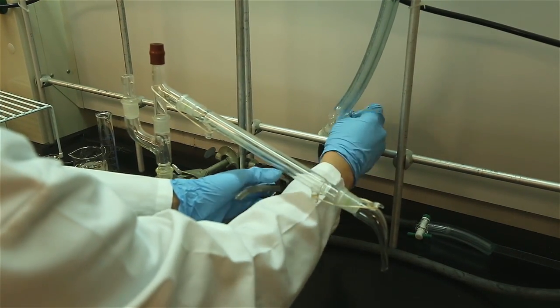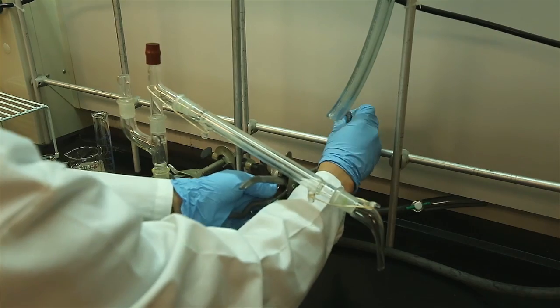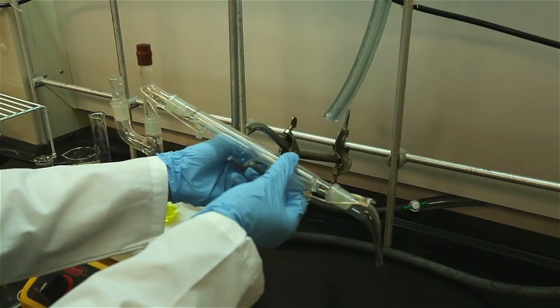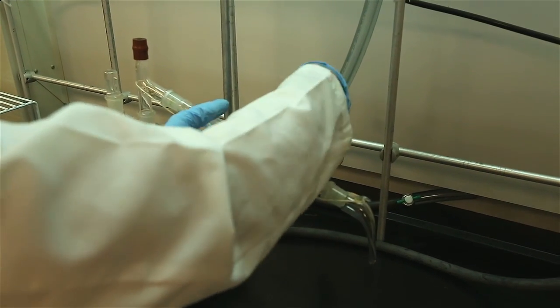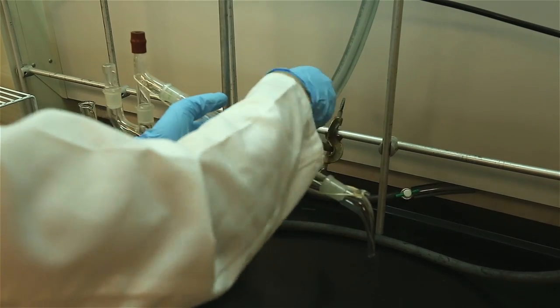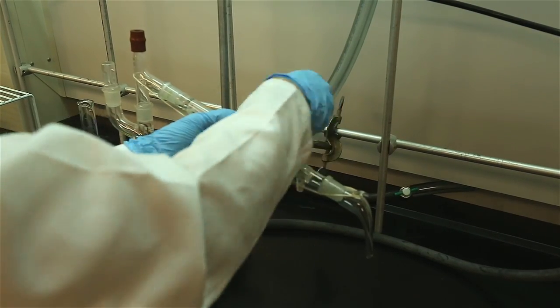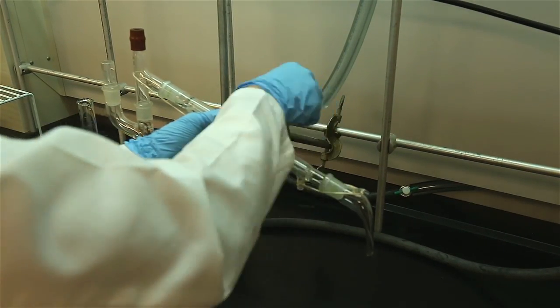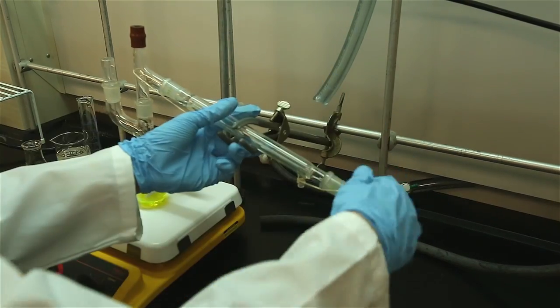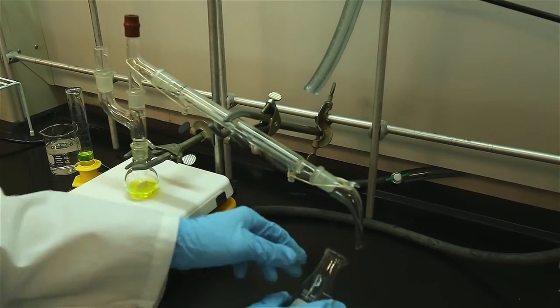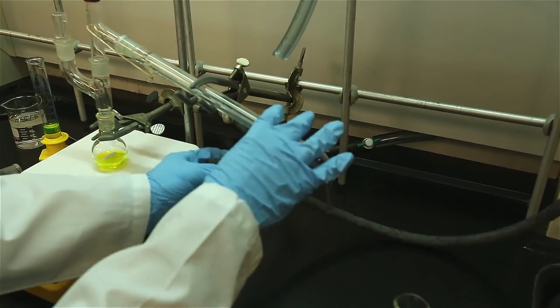Although simple distillation is very useful in an organic chemistry lab, there are limitations to this technique. A simple distillation does not have the ability to separate a mixture of two or more liquids where the composition of its vapors is the same as the mixture itself. This mixture is known as an azeotrope, and if you take physical chemistry courses, you will learn about these mixtures.